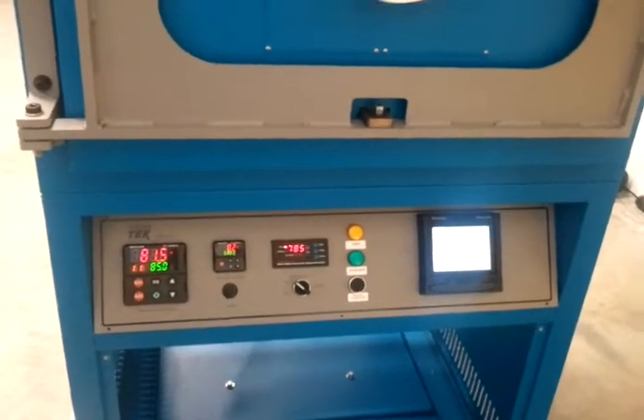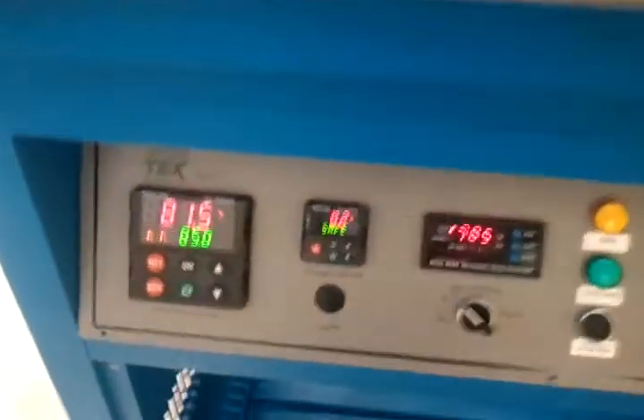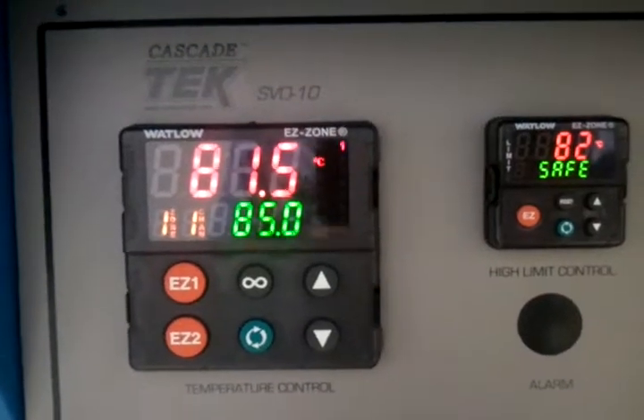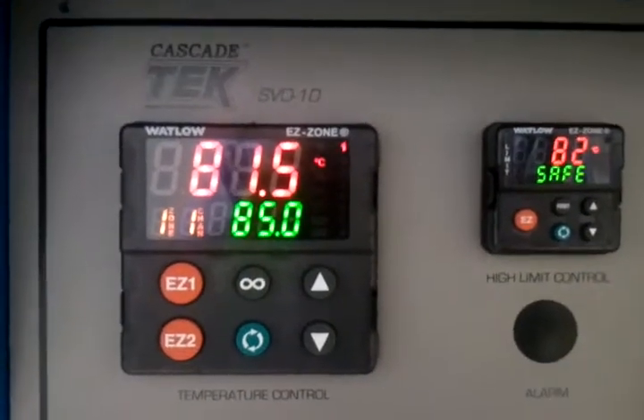All right, let's make some ice cubes in a vacuum oven. Cascade Tech SPO 10 oven, preheated to about 80°C — that's about 175, 180 degrees Fahrenheit.